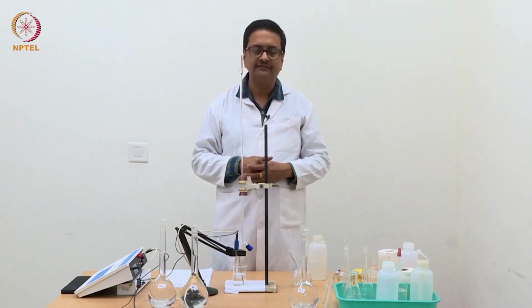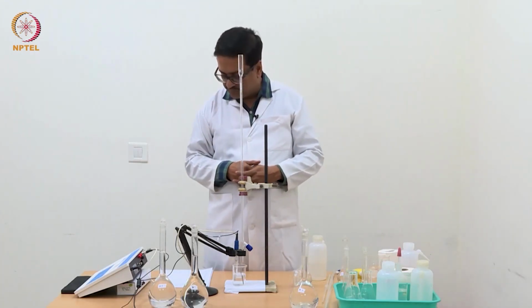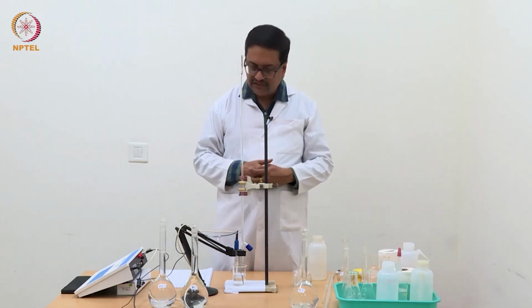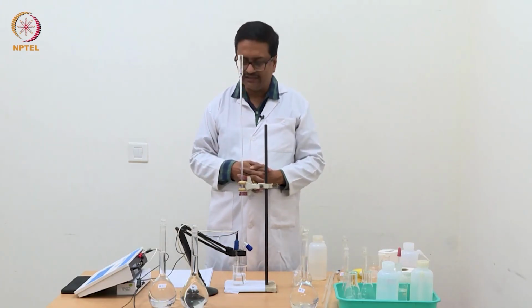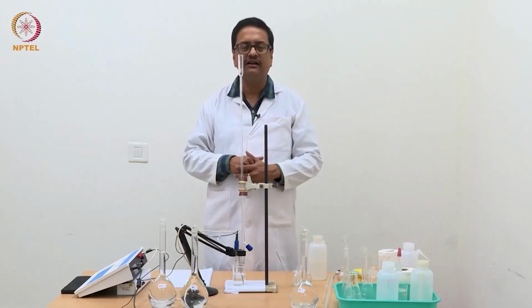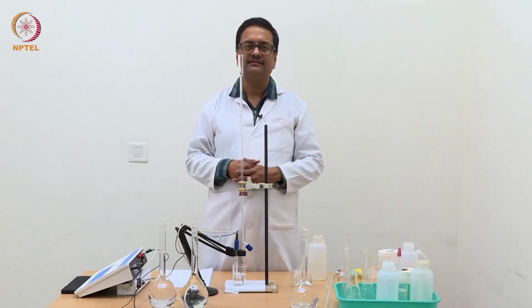I hope you have followed this experiment and you will be able to do this experiment in future, and in the next experiment we will demonstrate the acid base titration using a dibasic organic acid, where you can understand that there will be two pKa values and there will be two sudden increments in pH during the titration.